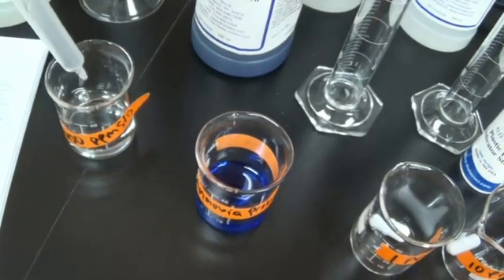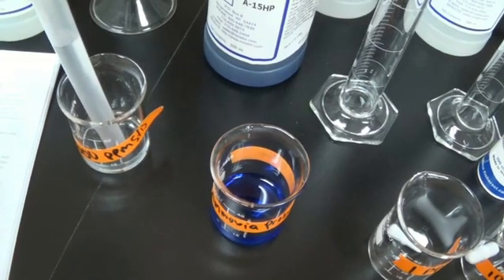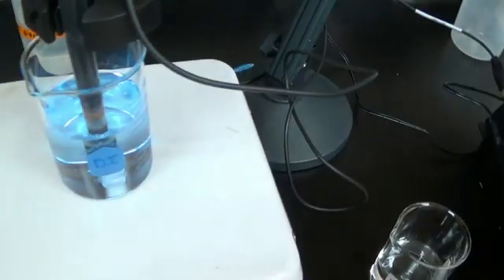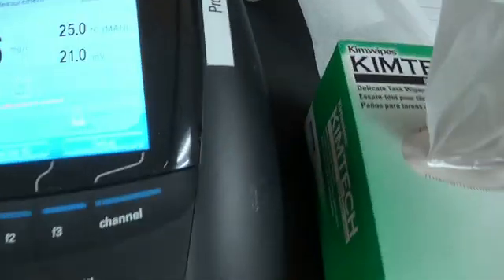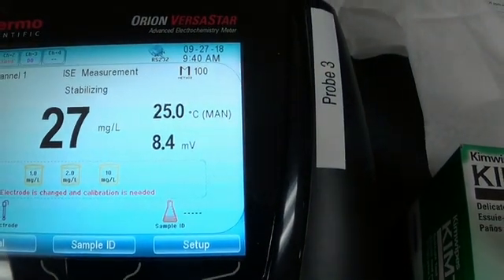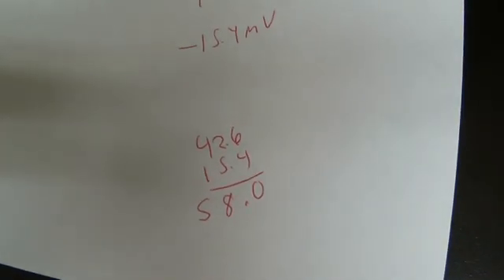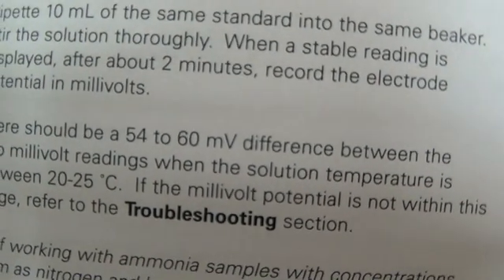So next I'm going to add 10 ml of the 1000 ppm standard. And then I'm going to wait for the millivolts to stabilize. Alright, it is ready. I'm getting a minus 15.4 millivolts. I'll write that down. Alright, I see the difference between the two is 58 millivolts. And what we want is between 54 and 60. So we are good to go.